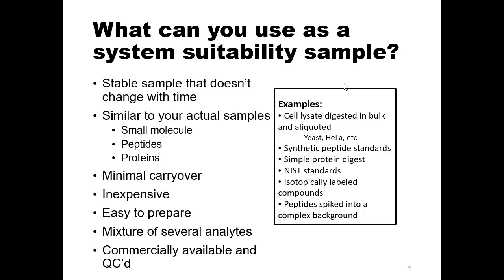I don't remember the name, but it's an OpenMS based workflow. I'm not 100% happy with it, but for discovery, the setup is pretty much the same as compared to this program.